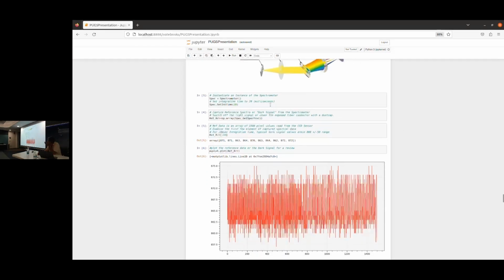One of the variables to play with here is the integration time. This is the exposure time of your camera. The longer you integrate, the larger signal you can accumulate. Also, it means you can saturate the sensor. Also, it means that a smaller signal can register with a larger integration time, subject to the noise floor, or noise limits, of the device.